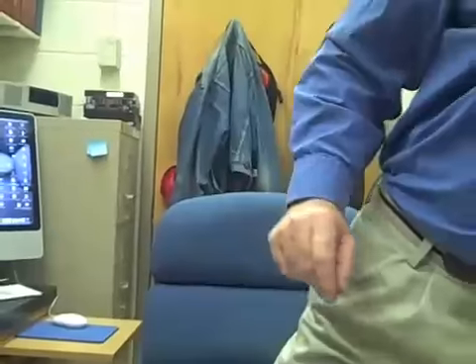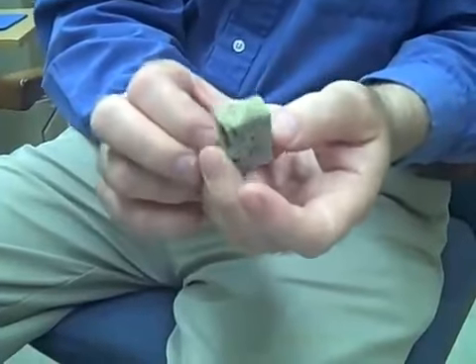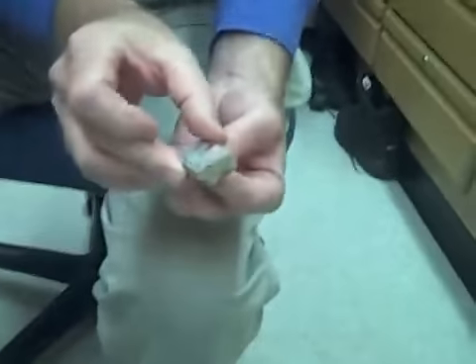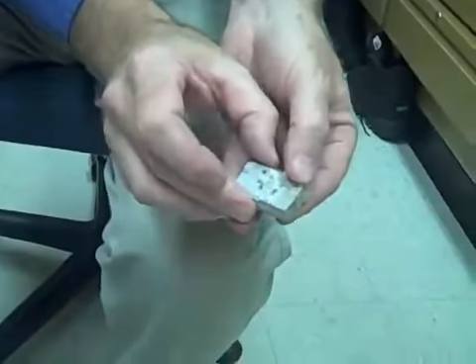One of the things that a geologist does with a core sample such as these here is to cut them on a diamond saw and then make a very thin slice that we call a thin section. And I can show you what one of those looks like. First of all, we take a piece of the rock and cut it into basically a rectangular shape, and that will fit on a microscope slide such as this right here, and it gets glued onto that microscope slide like that, minus all the writing. And so this side, we would glue that side right there.